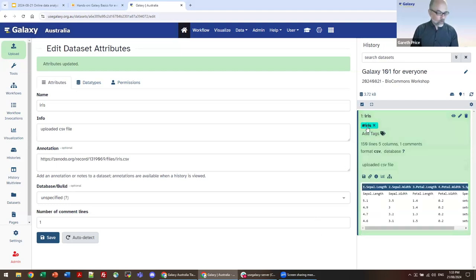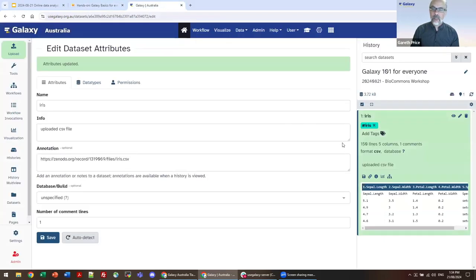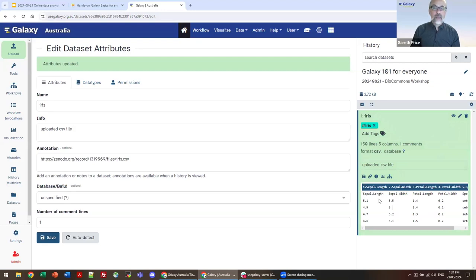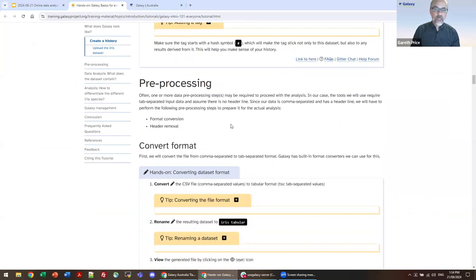As you add more tags, it works its way through a color wheel assigning colors. So that's all we've really done — the highly necessary and somewhat underwhelming activity of bringing data into Galaxy. But the most important thing we've done is inspect that data set and confirmed that it conforms to our understanding of what we imported.